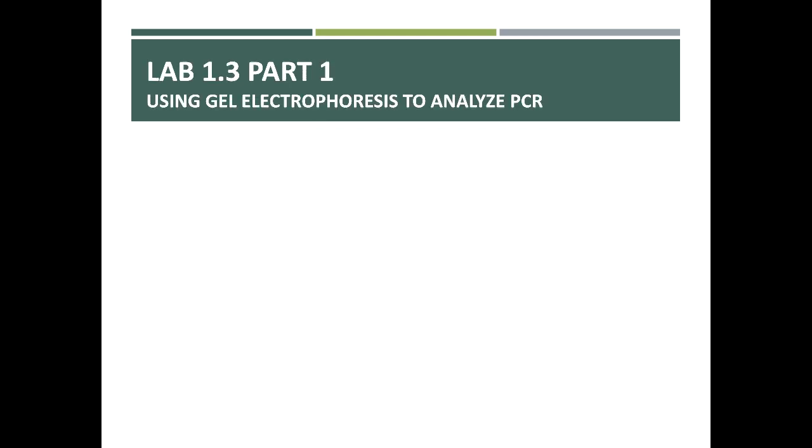As I said before when we talked about PCR, we understand that you won't be able to physically do these methods and procedures during the online lab, but it's important for you to understand some of the basic skills and concepts. And gel electrophoresis is a very standard molecular biology technique that it's important for you to know, because one day you may be working in a lab and it'll be important for you to understand these features.